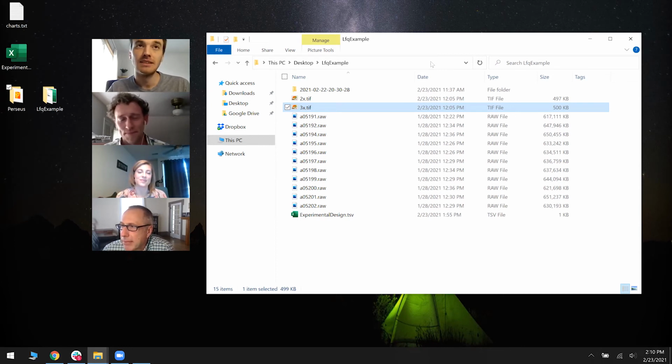Yeah. Okay. I should note that in older versions of Metamorpheus, we used the top 3 protein, which wasn't that great. We've since switched to median polish, which is pretty good. I think it's about as good as MaxLFQ, but it can handle more data. It can compute faster when there are a lot of data files. So I'll talk for a second about TOMLs.